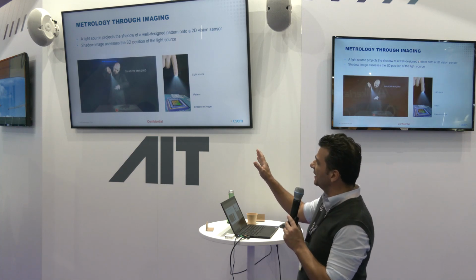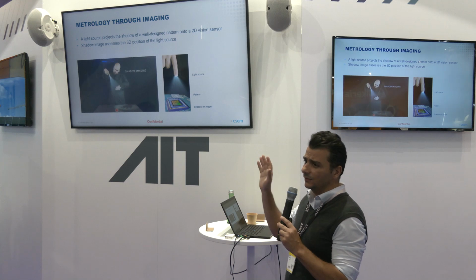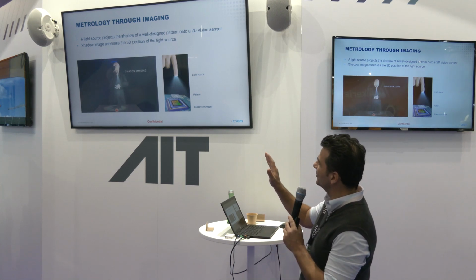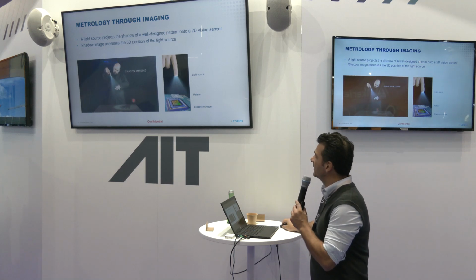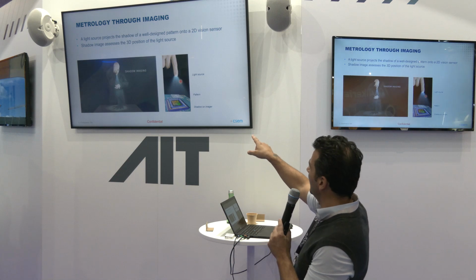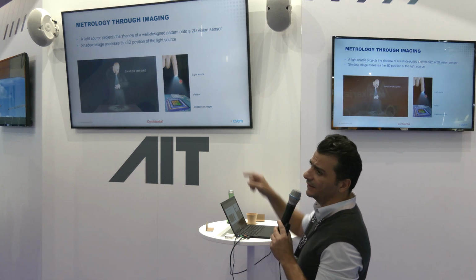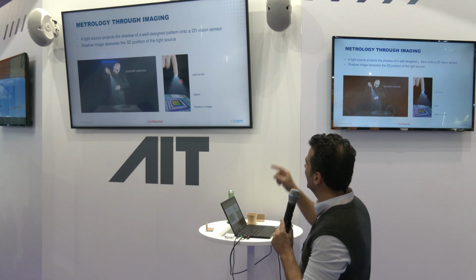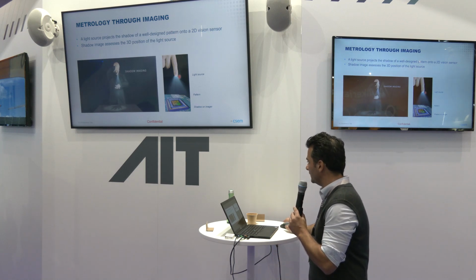Here the main point is that we are constructing the full image, the full shadow image. On the left is a simplified representation. And on the right is a typical implementation where we have an imager, a pattern grating, and on that pattern grating we have fiducials to ensure the repeated phases are in line, and the third aspect is a light source.